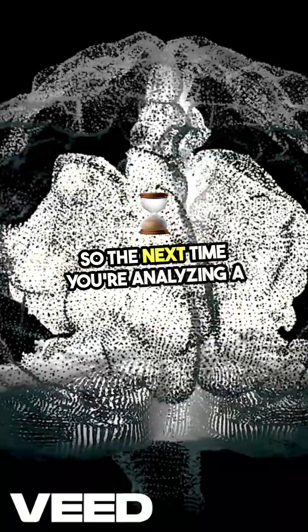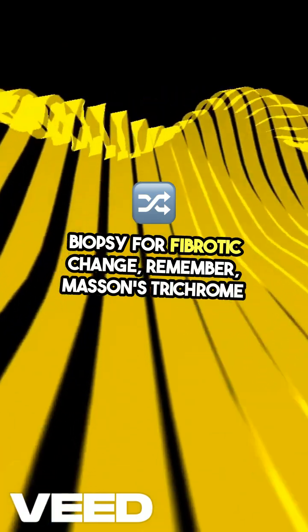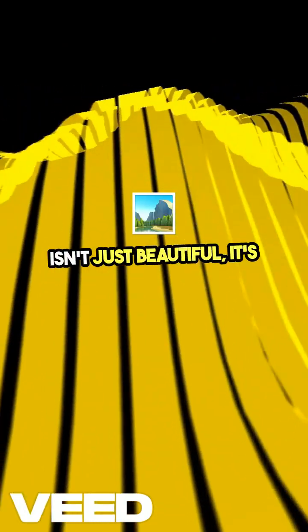So, the next time you're analyzing a biopsy for fibrotic change, remember Masson's trichrome isn't just beautiful — it's incredibly informative.